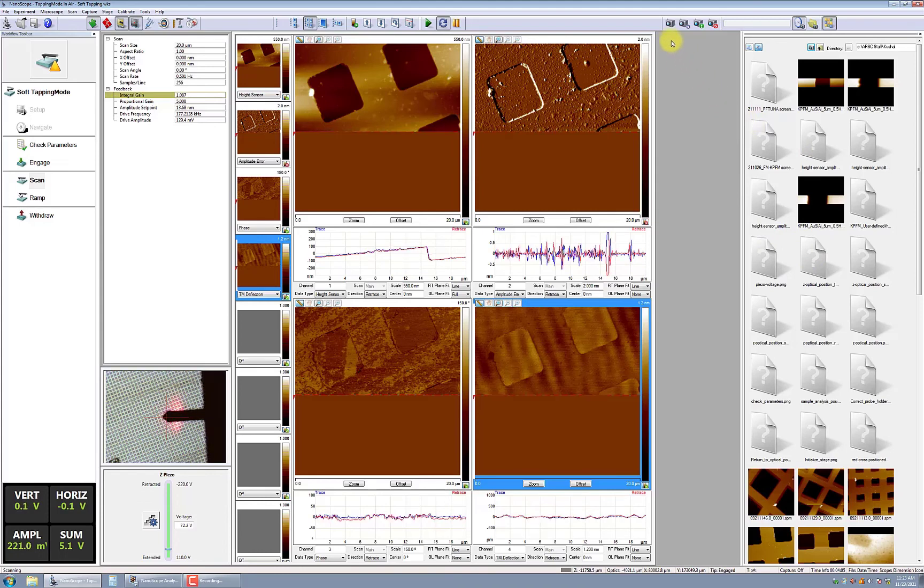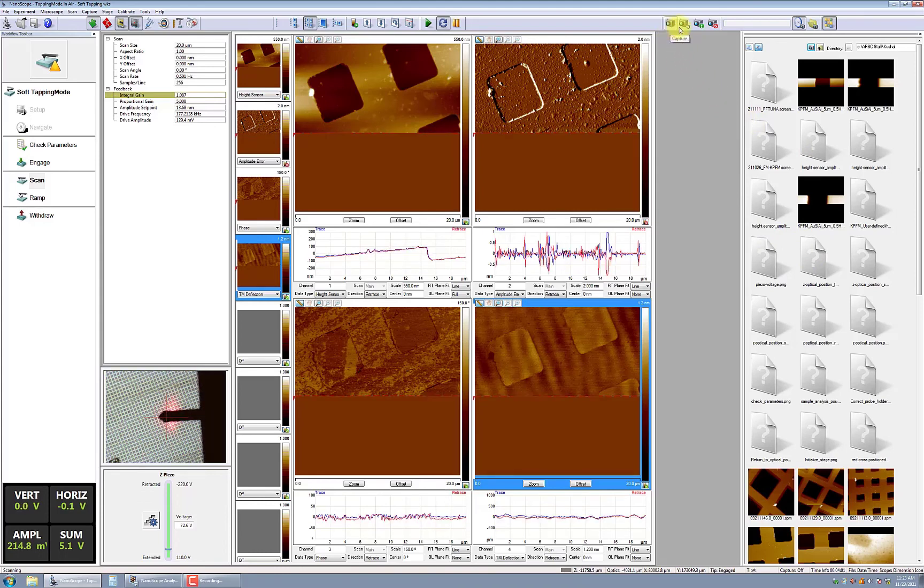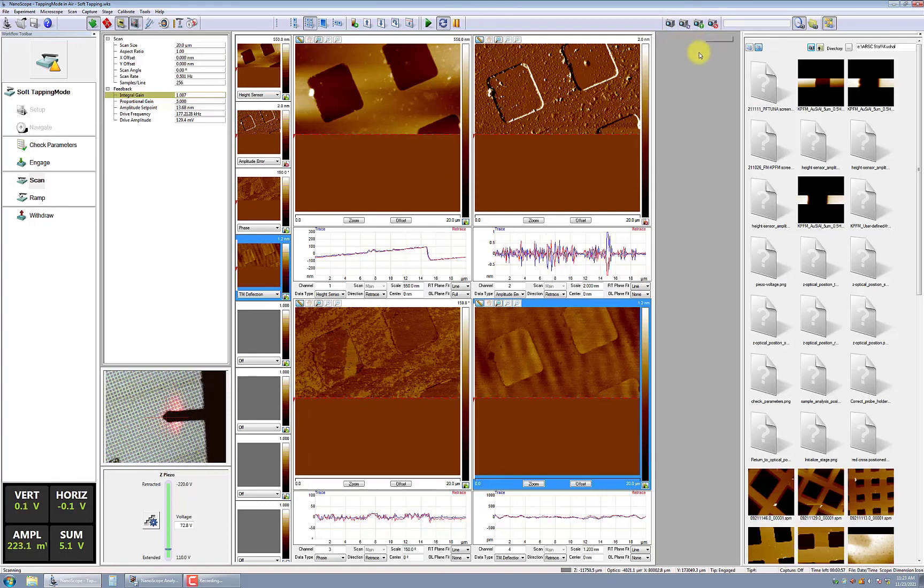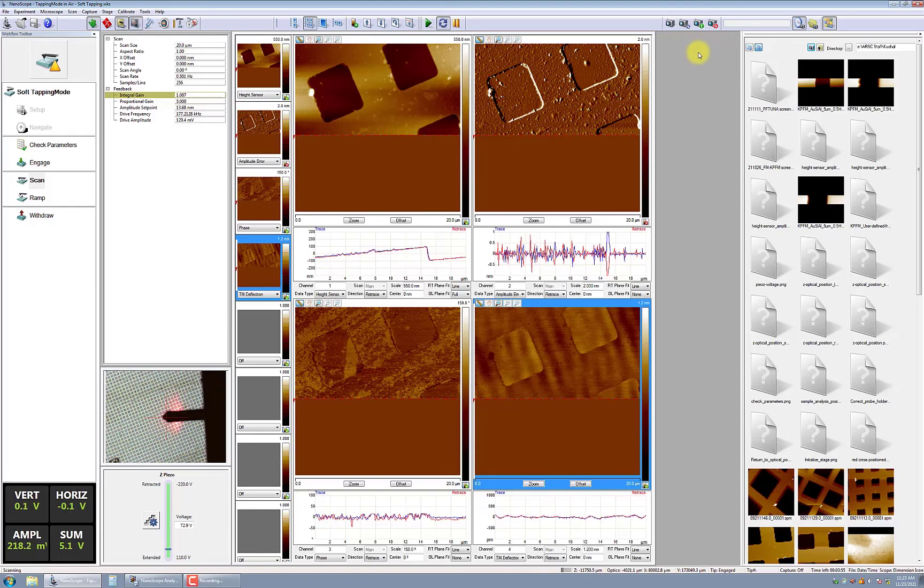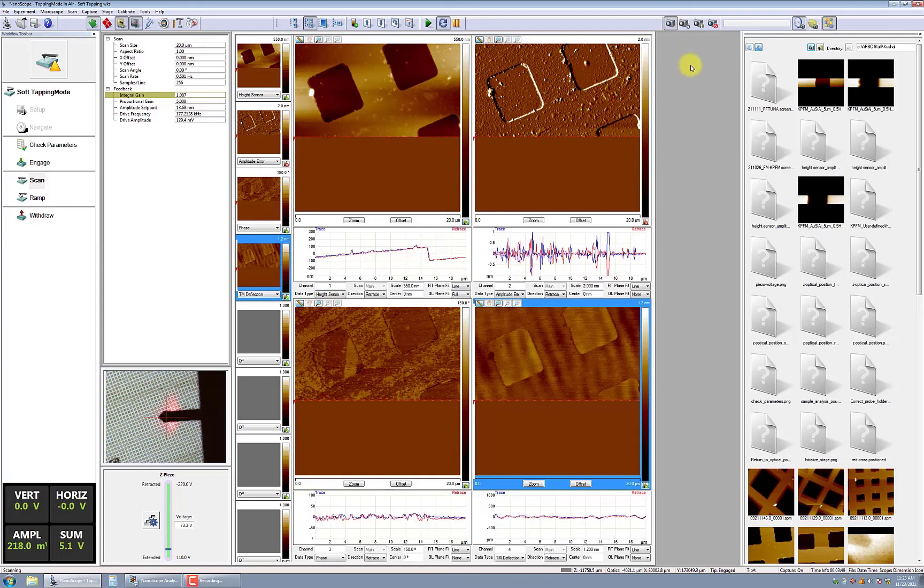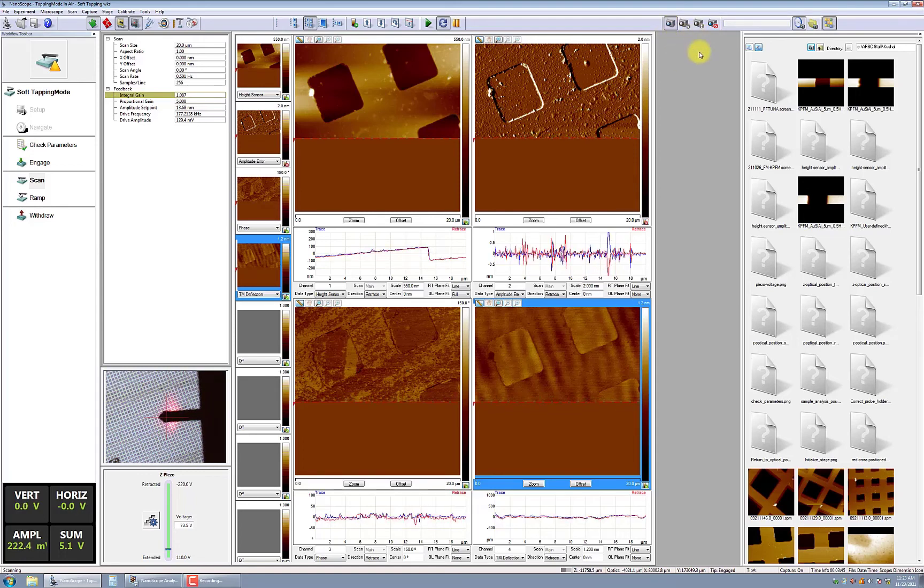The captured data will show up on the side panel. This data is now available for additional analysis using either nanoscope analysis software on the computer or offline using a program like Gwidian. Please refer to the AFM Analysis Application Note for more information on common analysis methods.